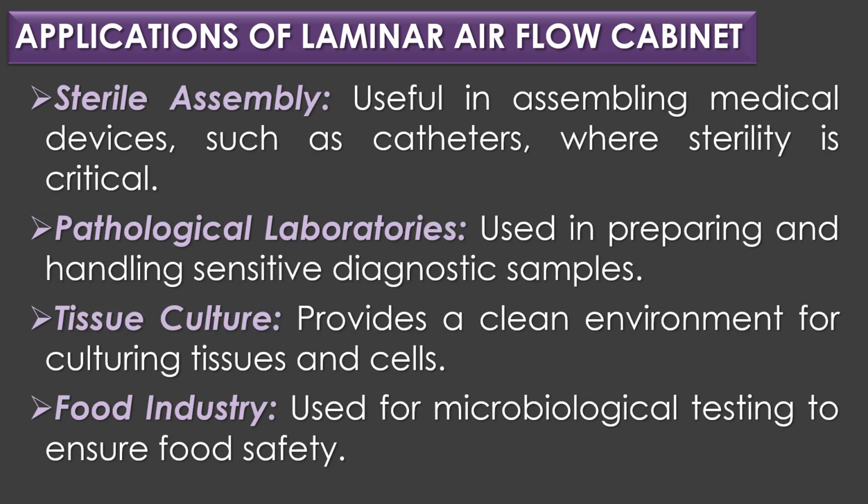In sterile assembly, laminar airflow cabinet is very useful in assembling medical devices such as catheters where sterility is critical. In pathological laboratories, laminar airflow cabinet is used in preparing and handling sensitive diagnostic samples.